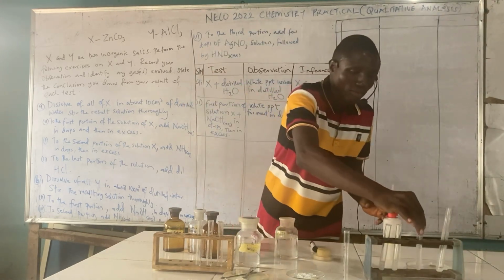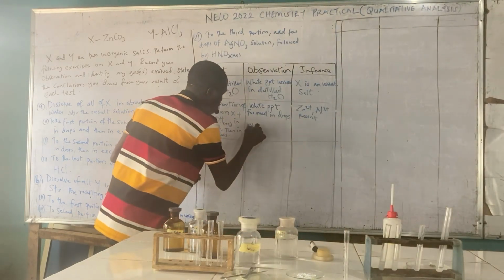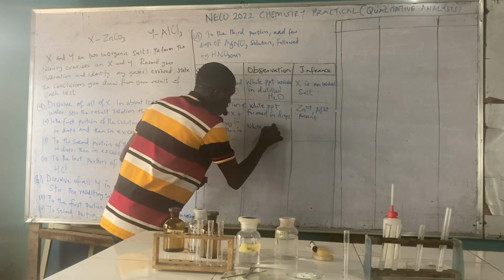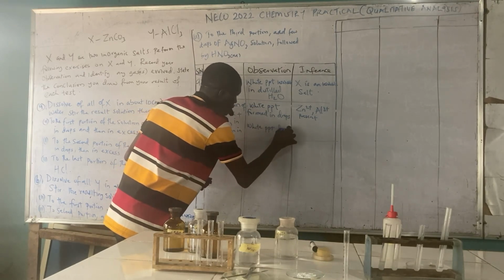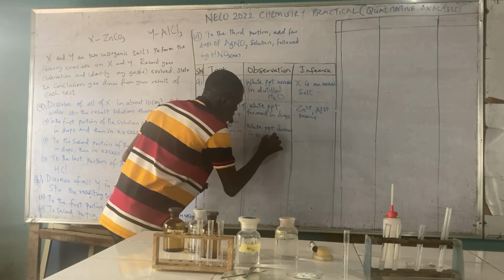So we are done with the first analysis. The white PPT dissolved in excess sodium hydroxide.